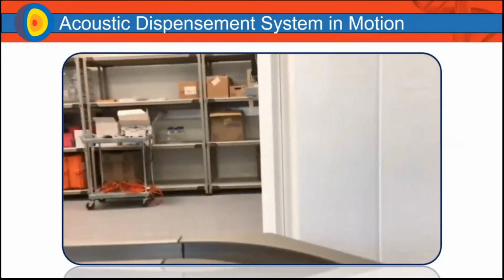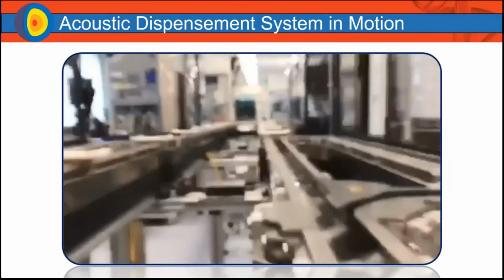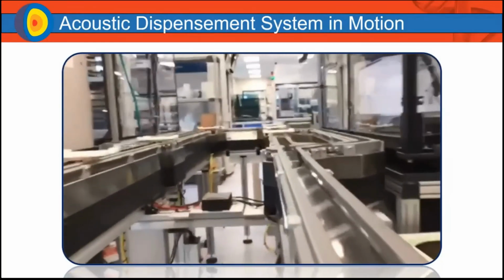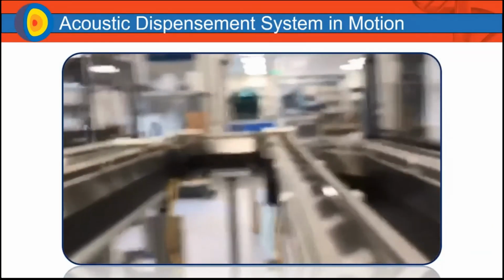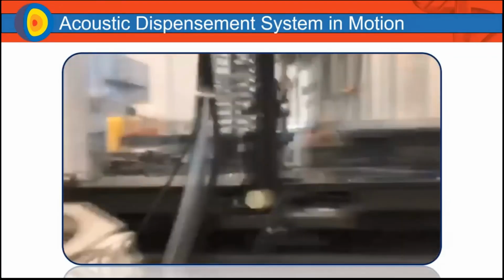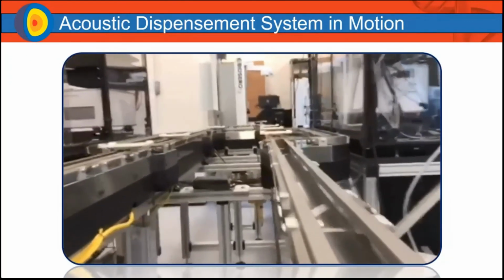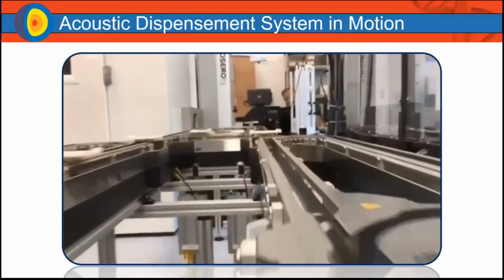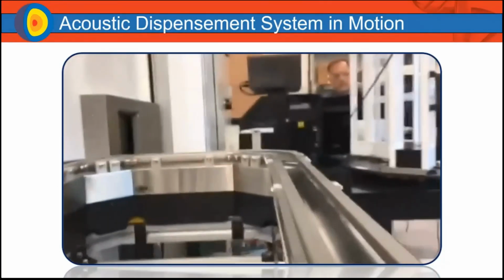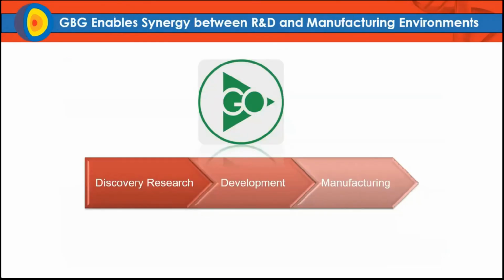So essentially, right now, a master compound plate is being put on to the system, and then we're going down the track, and we're able to bypass different workstations. So we have multiple Echo accesses integrated, and those are getting jobs throughout the day. And so some of those are available, some of them are not, some of them are down for PMs, but this solution essentially allows us to maintain operation throughout this process in a 24/7 environment, rather than just an 8 or 10 hour day while people are present.